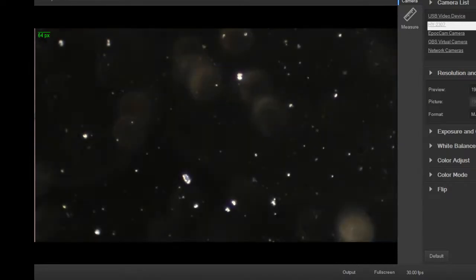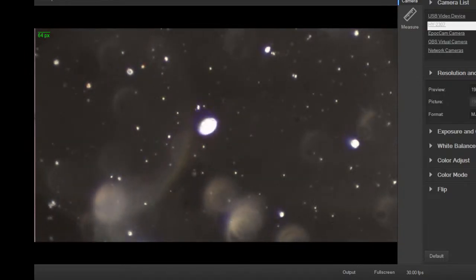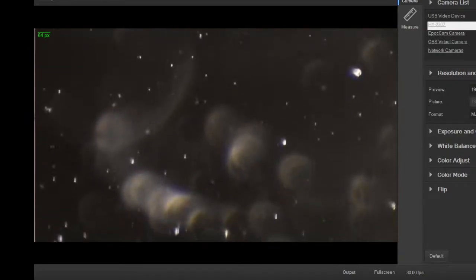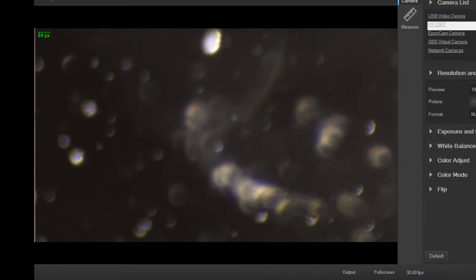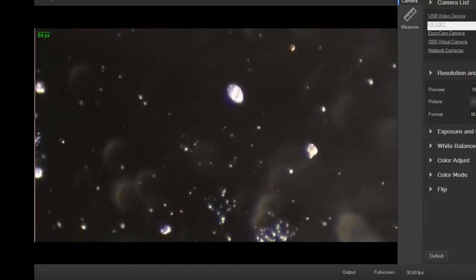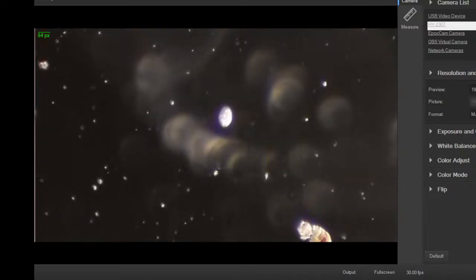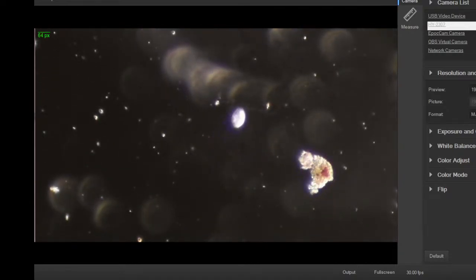Let's try a little dark field. This is some contrast here. The tricky part is to get it so it's not so overexposed. This auto camera is kind of annoying. It's doing too much auto everything. Where you going, dude? What's going up there? Sometimes you get a nice little pattern, you can just kind of hang, but this kind of guy's just doing whatever the hell he wants.